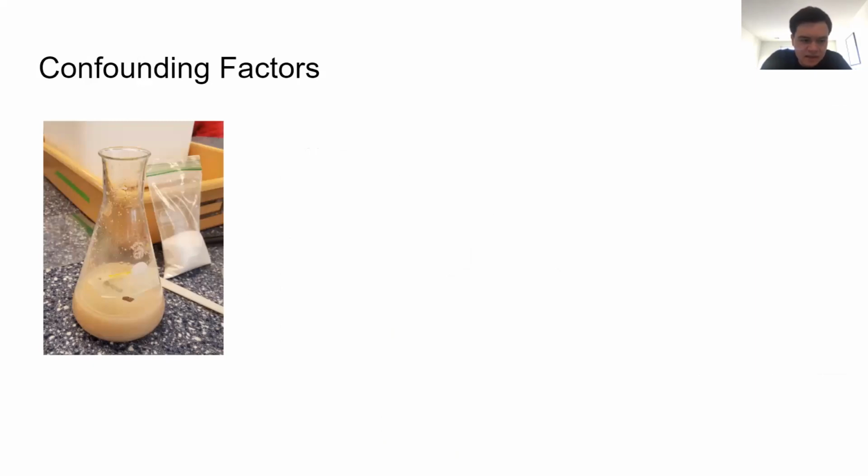Furthermore, we had to limit the amount of glucose the yeast were exposed to, for by the Crabtree effect, in high concentration of glucose, yeast will actually repress respiration. To try to prevent this effect, we kept concentration of sugar relatively low by following the examples of 2 previous labs. We also had to keep the temperature of the yeast solution and water bath constant for each trial by using a styrofoam box as insulation so that changes in heat did not affect the rate of the reactions producing CO2.